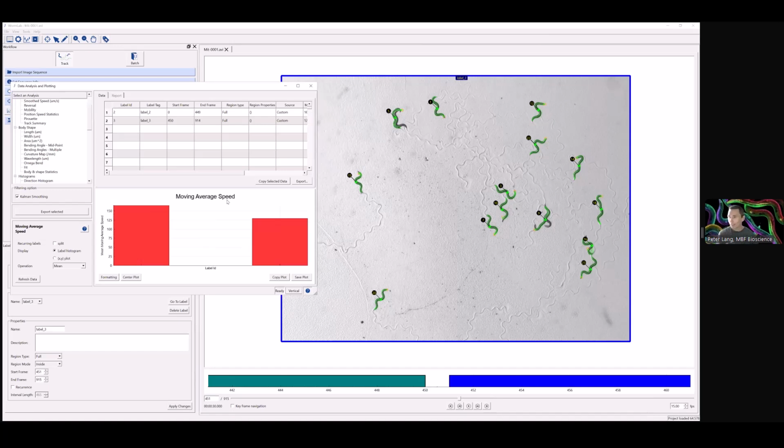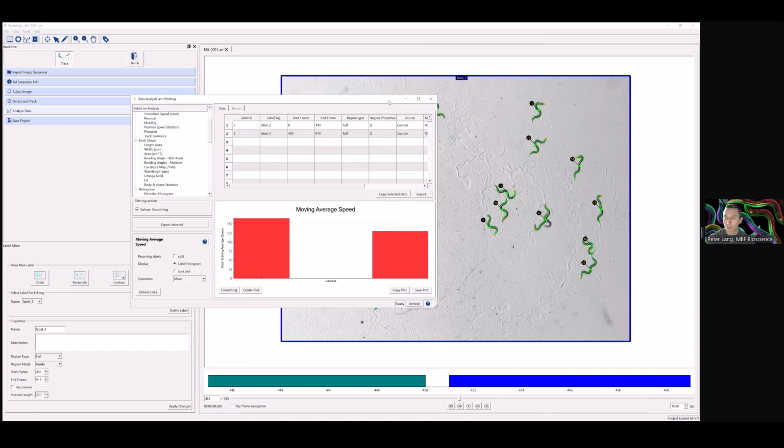Or you can chop that up into whatever time groups you actually want. But the idea is you track the entirety of the video, you have all the information. What do you now want to pull out of all that information? Using this label analysis tool, you can look at your data a little differently and interrogate it and ask different questions that may be pertinent to your research. So that's one more advanced type of analysis that I wanted to review.